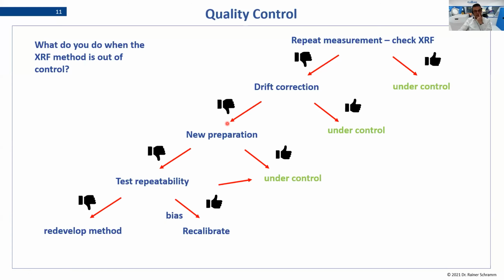This morning we had the same presentation in German, and there one participant mentioned that he had a situation where a wrong film was used in the sample preparation, and so he just exchanged it, and then he had it under control. So this would have been an example for this part.